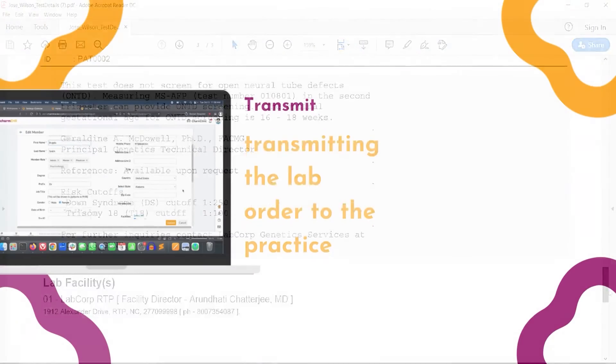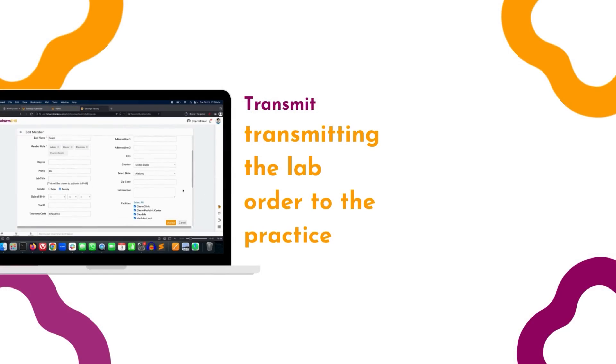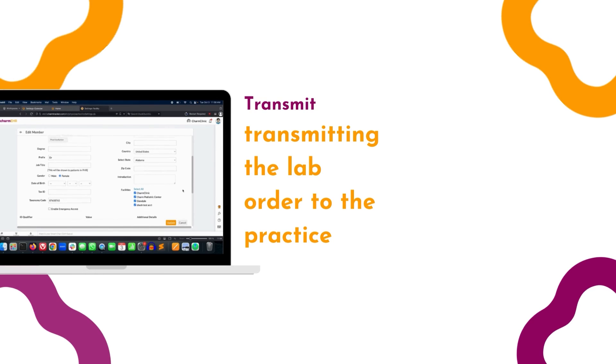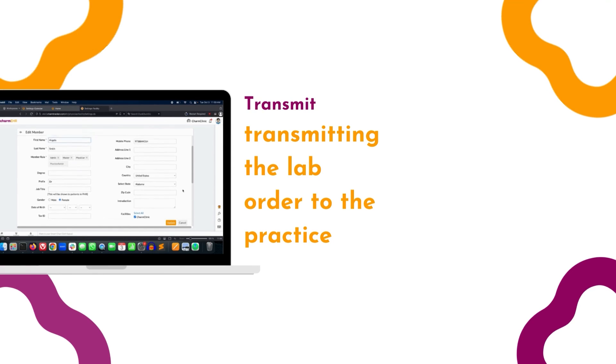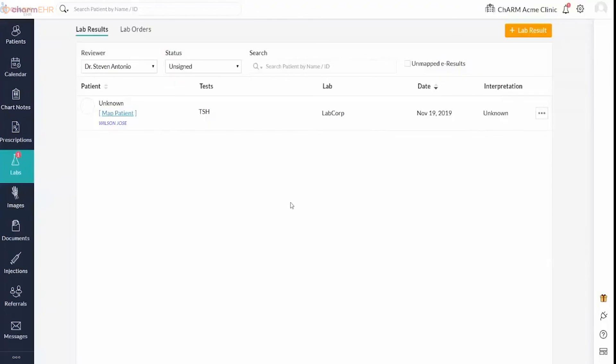Manually mapping a patient to a result. Unsolicited results may be received with incorrect patient details. Such results cannot be mapped to the patient automatically. They are listed in the Lab Results section with an unknown patient.